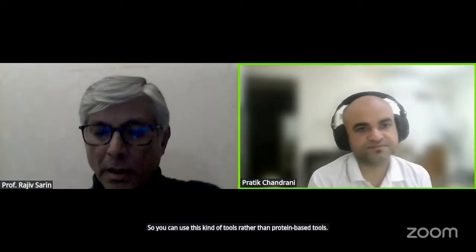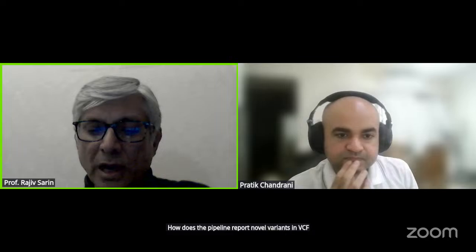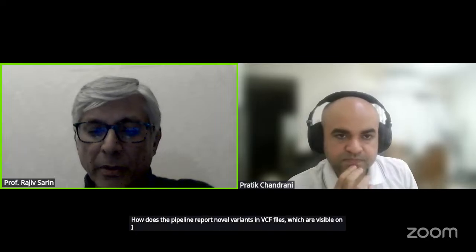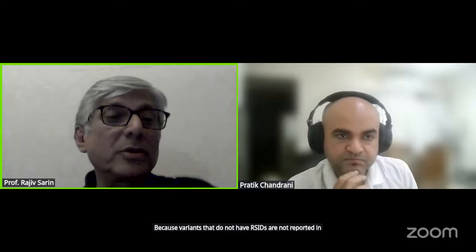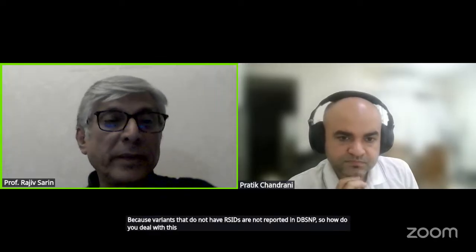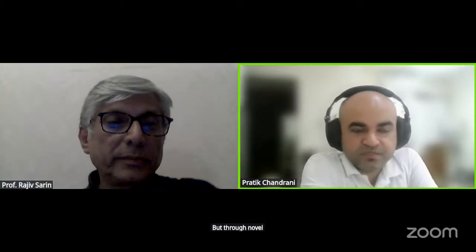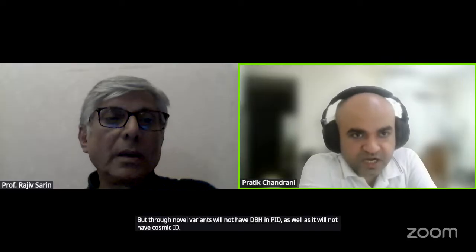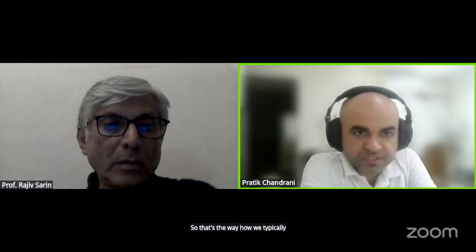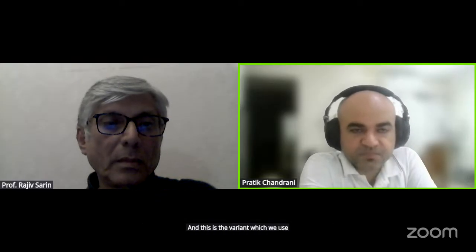Okay. Now, Fatma Islahi asked: how does the pipeline report novel variants in VCF files which are visible on IGV? Because variants that do not have RSIDs are not reported in dbSNP. So, how do you deal with these novel variants? Correct. Novel variants will not have a dbSNP ID as well as a COSMIC ID. That's how we typically identify a potential novel variant, and this is the variant which we use for functional prediction.